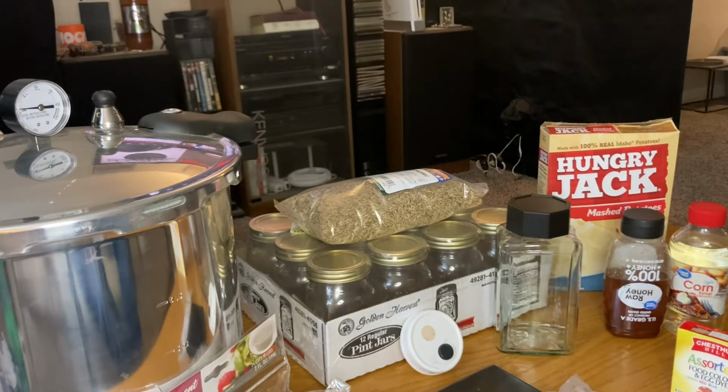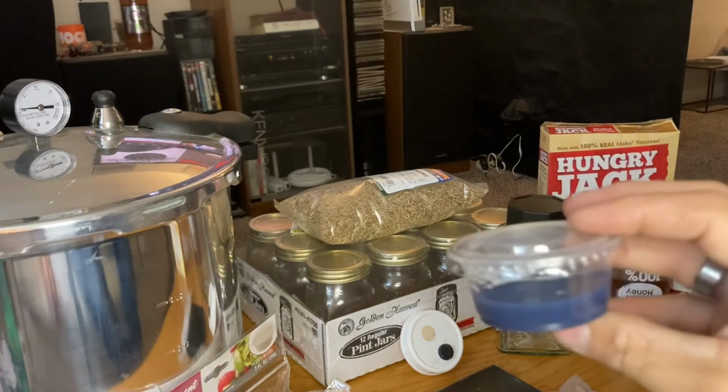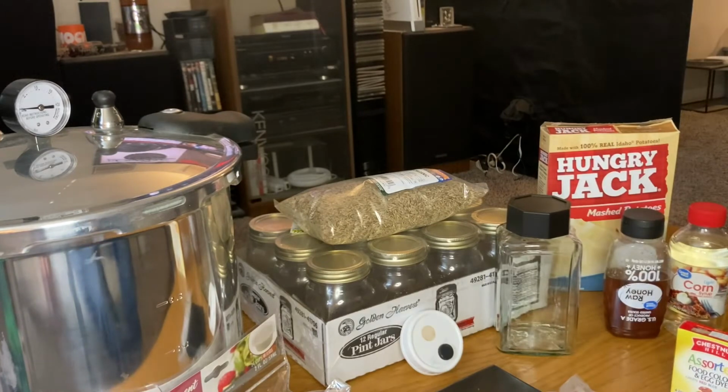So the 3-2-1 ratio would be 3 grams potato flakes, 2 grams agar powder, and 1 gram corn syrup or honey. So I usually do double that to make about I would say 10 of these little condiment container agar dishes. So basically I would double that, and I would do 6 grams potato flakes, 4 grams agar powder, and then 1 gram corn syrup and 1 gram honey. So that is the very simple agar recipe that I will be going over.